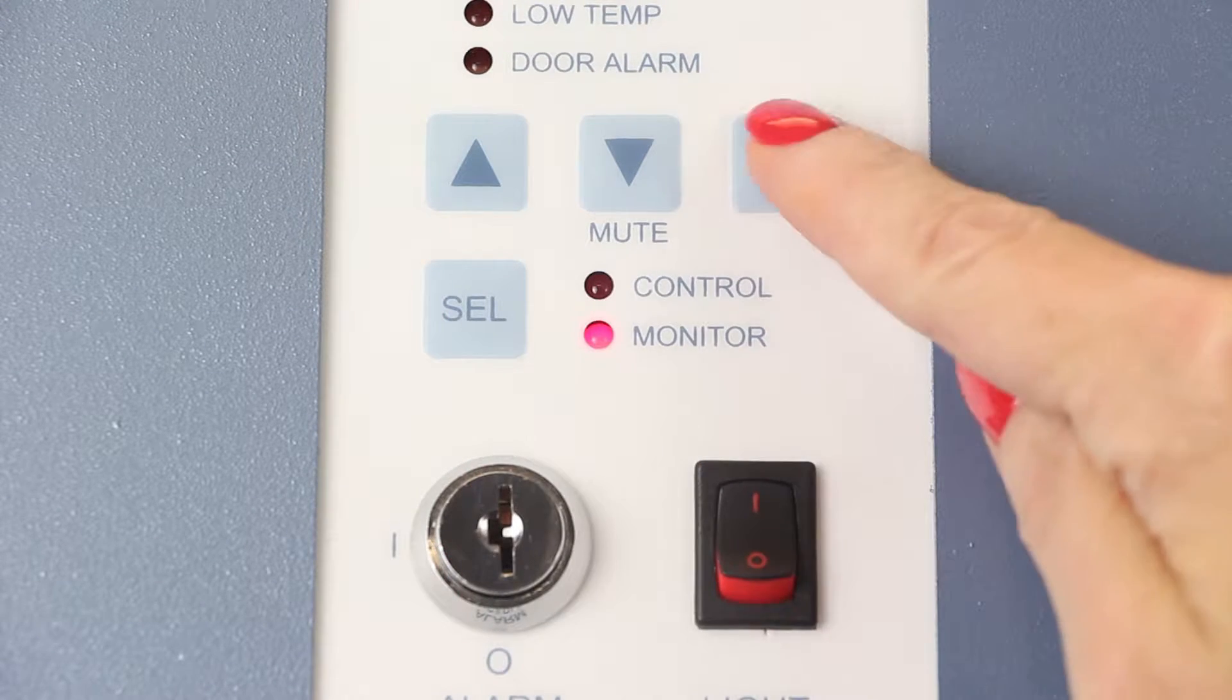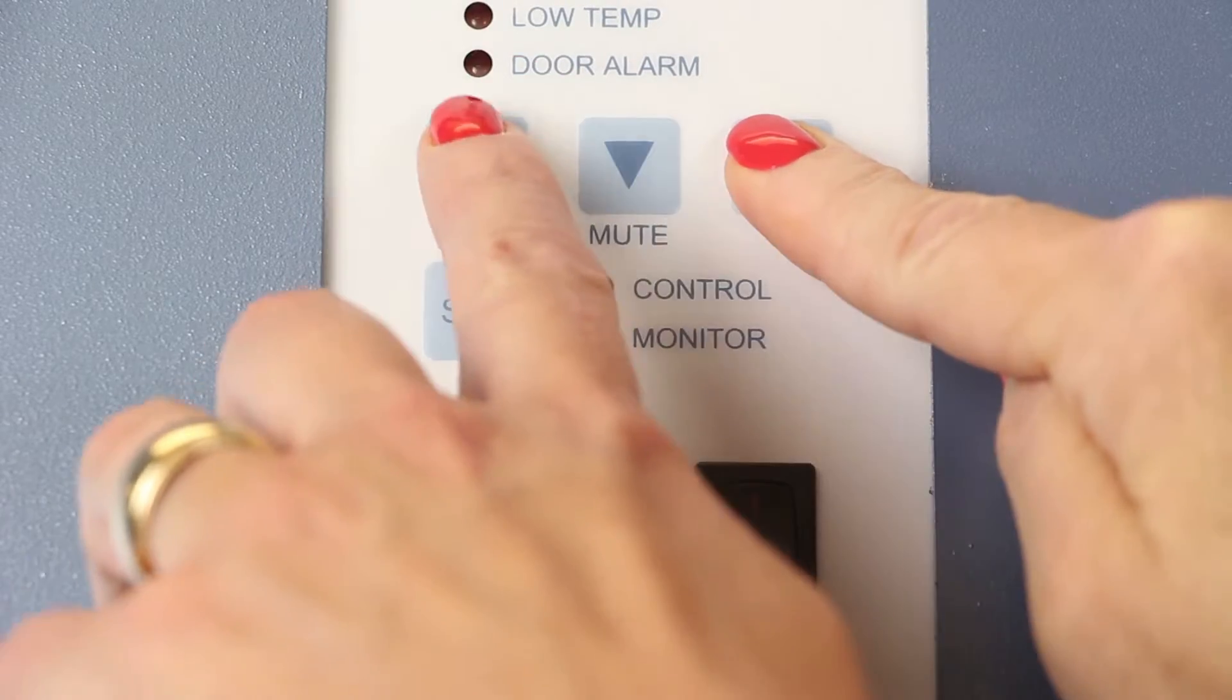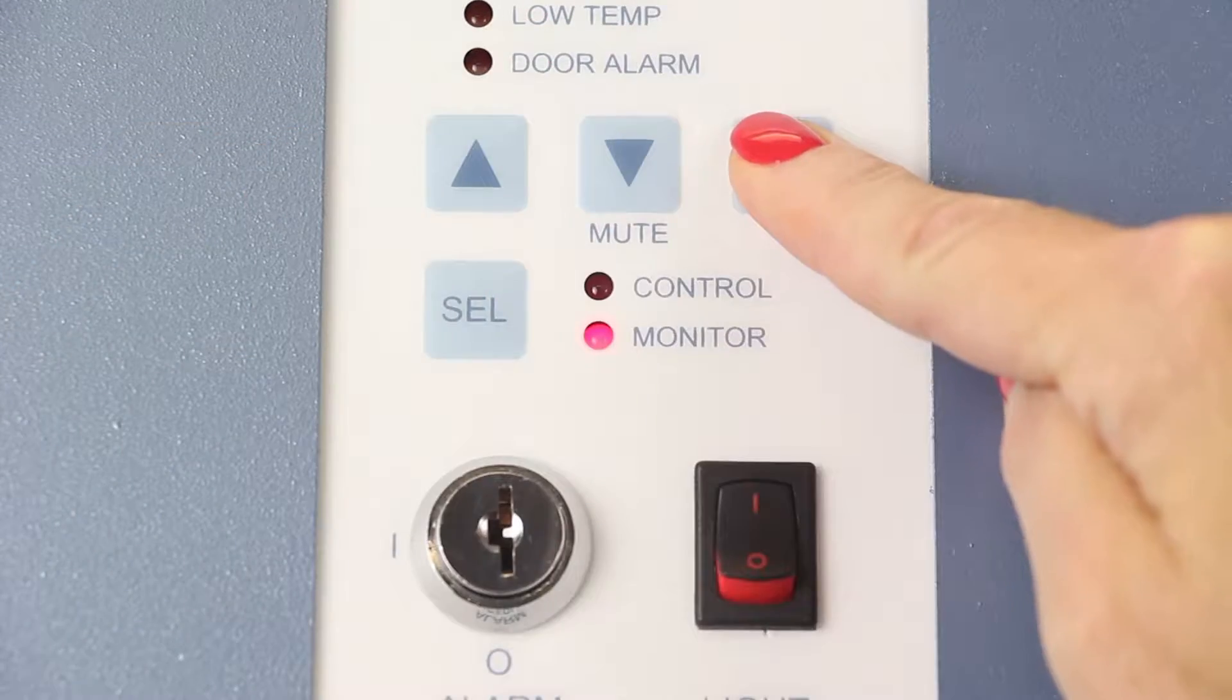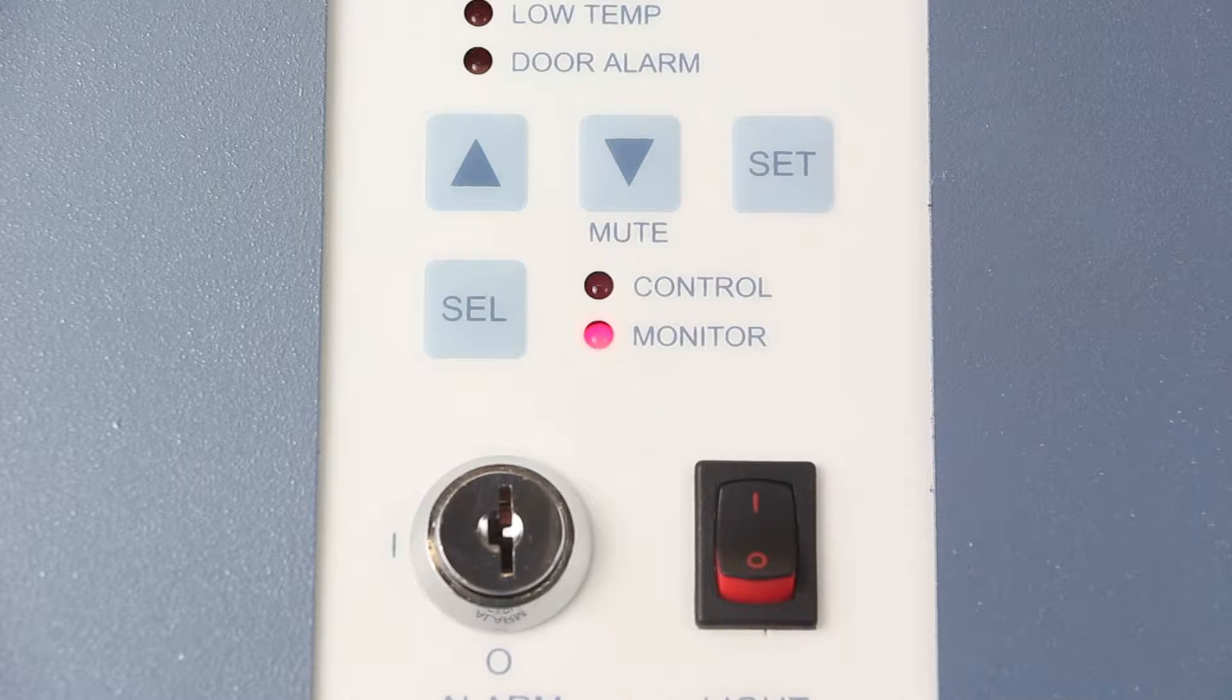These include high and low temperature alarms, a door open alarm, and a power failure alarm. If needed, temperature set points and alarm settings can be adjusted within the controller.